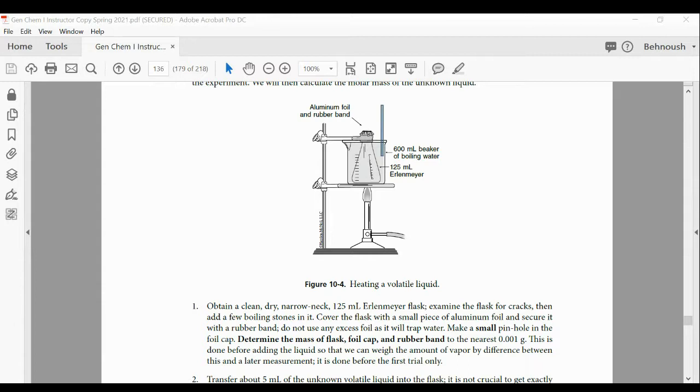Okay, did you look for pressure? How do you find the pressure? What do you record for pressure? And then Danielle, Davis, Sroti, Katie, tell me, what do you use? How do you measure the volume? How do you measure the volume for the flask? Davis, I'm sure it should say something to record the temperature, the pressure. It should say something.